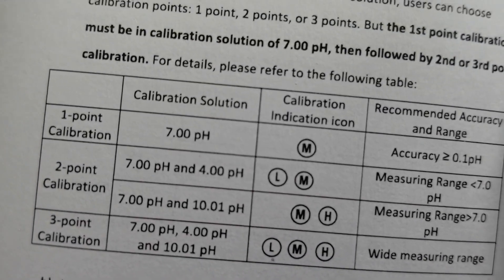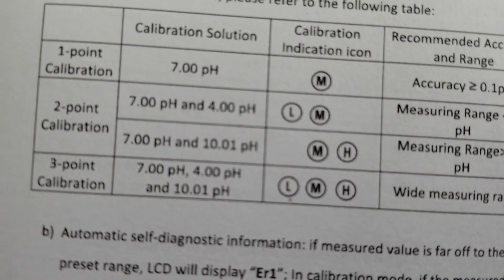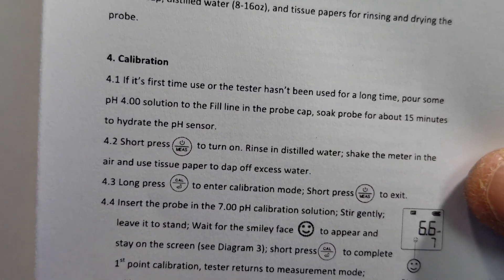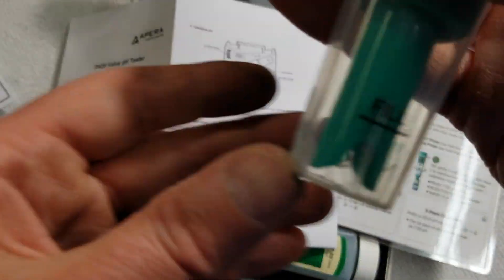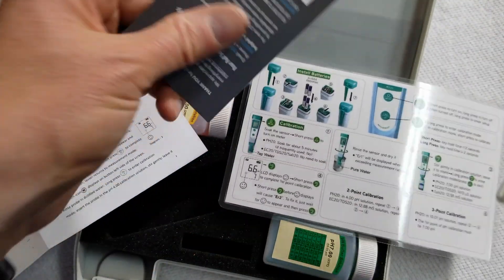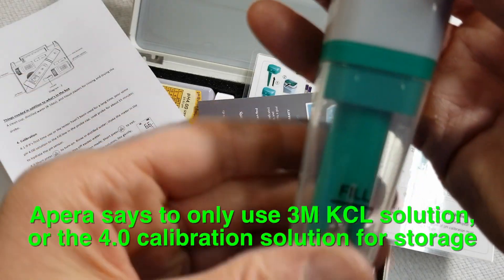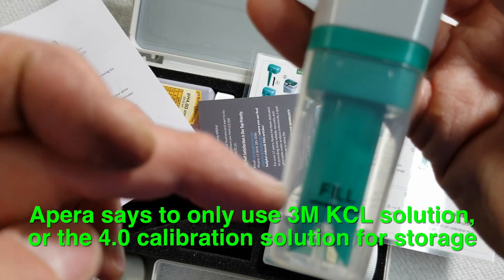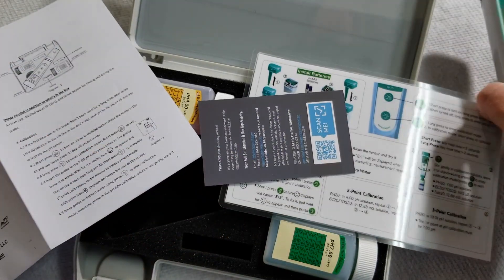So you can do up to a 3-point calibration. Typically what I've done — and this is what this comes with — the 7 and 4, so you would calibrate at 7 and then 4. There are some instructions on that. I believe you would store it with a storage solution. I'm not sure if it comes with that or if I use one of the KCL solutions I already have from the Blue Labs, but it gives you a fill line so you would store your probe in whatever solution you use. I need to read the instructions and see what I'm supposed to do with it.